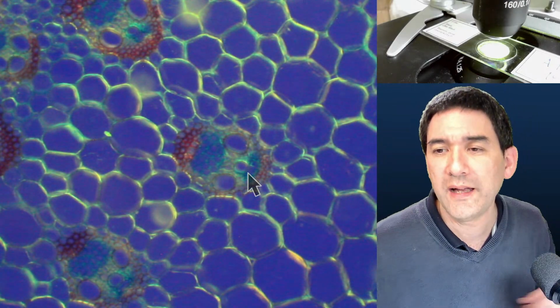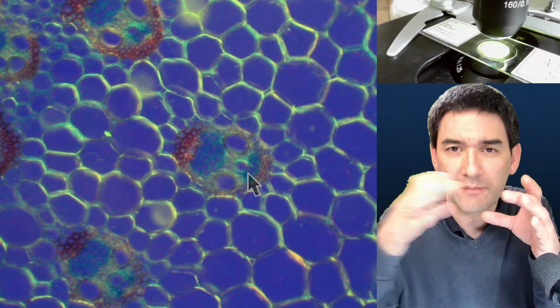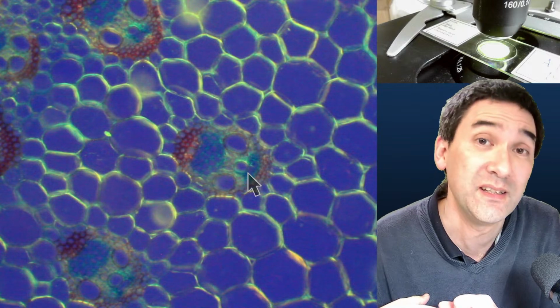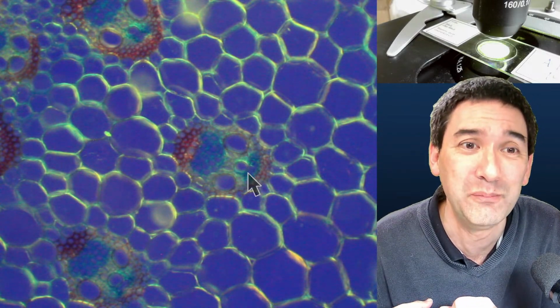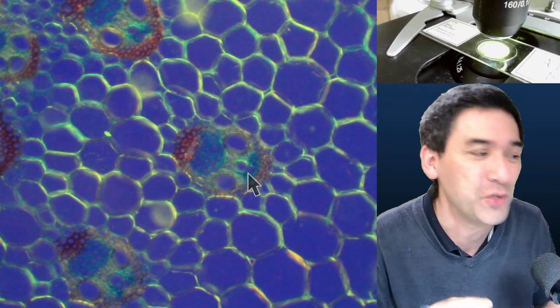Have you ever tried a filter with two or three concentric rings of different colors, basically rings like this? Yes, I've tried it, but I found out that, at least in the specimens that I used, the colors kind of got all mixed in the image, so I could not distinguish them anymore.